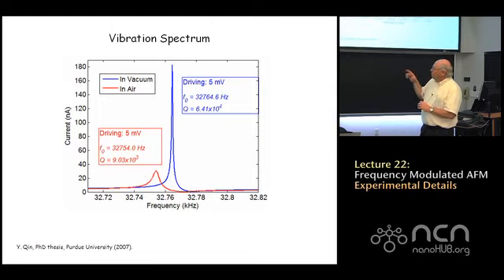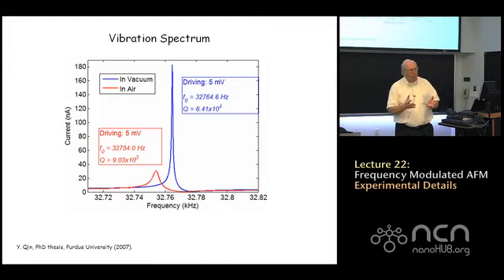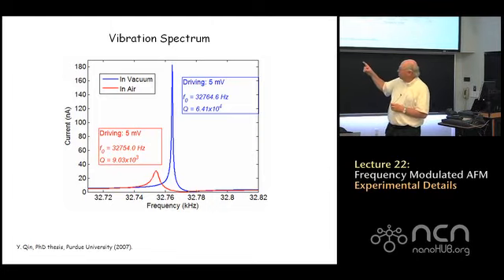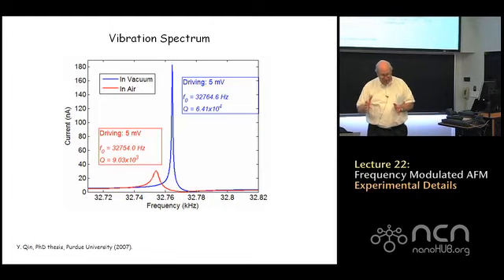And also the Q of the tuning fork drops. It drops by about a factor of 10, but it's still on the order of 9,000 operating in air. You compare a Q factor of 9,000 to a silicon Q factor of a few hundred, and you can clearly see that there are going to be huge advantages, for instance, to measuring the position of the peak in that tuning curve as the tuning fork is brought closer and closer to a substrate.